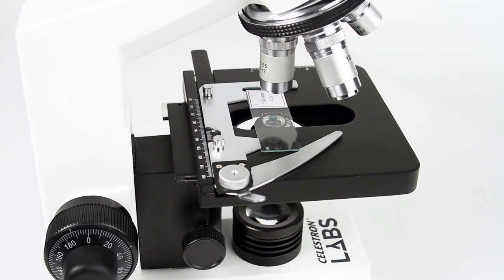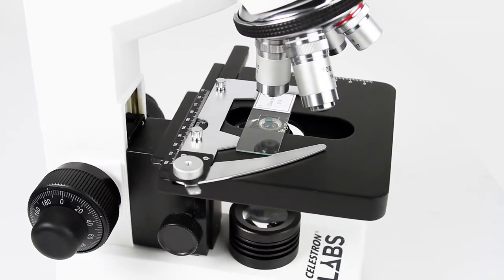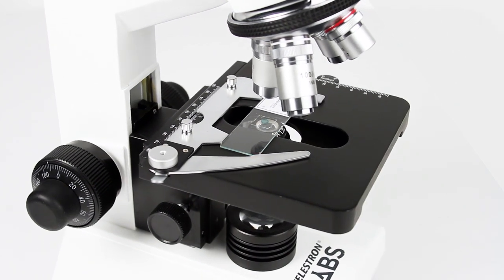Made from high-quality parts, these metal-bodied microscopes are durable enough for use in the classroom or a professional lab.